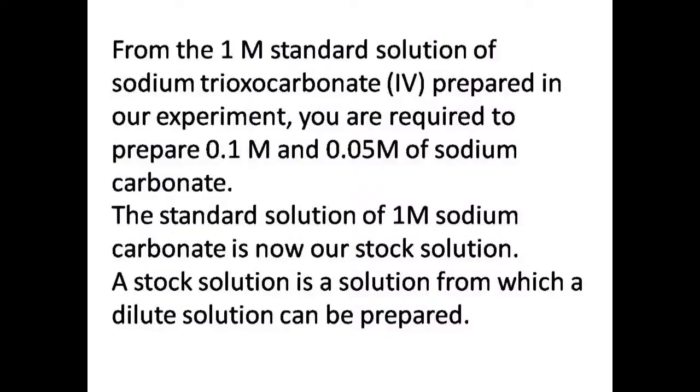From the 1 molar standard solution of sodium carbonate prepared in our experiment, we are to prepare 0.1 molar and 0.05 molar sodium carbonate. These solutions are of lesser concentration.